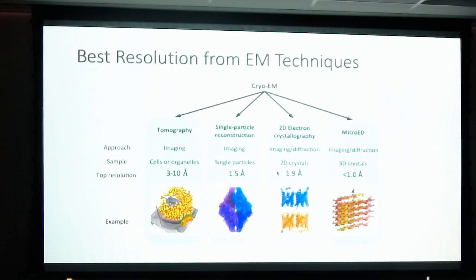And then microED is a technique which actually gives the highest resolution. You can get sub-angstrom resolution for small molecules and small peptides. We always talk about near atomic resolution, and this is the only one that is actually giving atomic resolution.